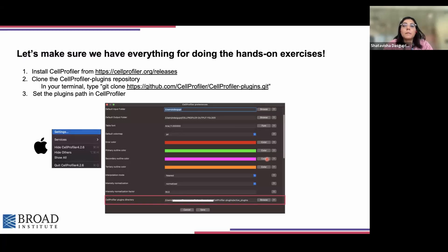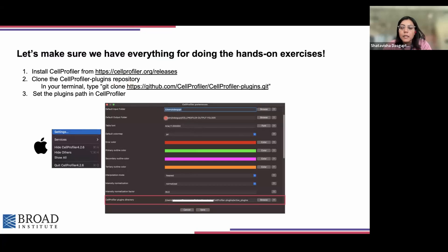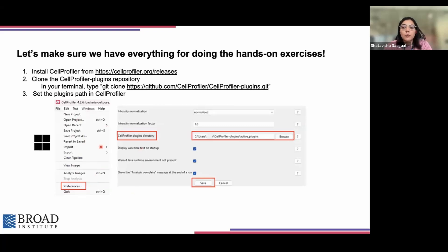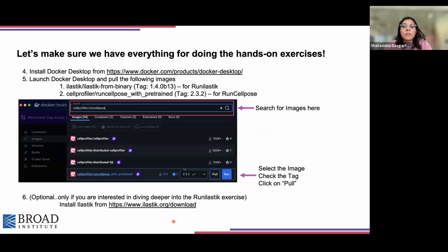Before we go into the hands-on, let's make sure we have all the programs needed. Please install CellProfiler from the link mentioned here — it's also been posted in the chat. We will need to clone the CellProfiler Plugins Repository; instructions are given here and we can go over that in the breakout rooms. Once the plugins repository is cloned, we just need to set the path in preferences, which will look slightly different on Mac versus Windows. We will also need Docker Desktop, which can be installed from the link here, and then pull the images needed for Run CellPose and Run Ilastik.